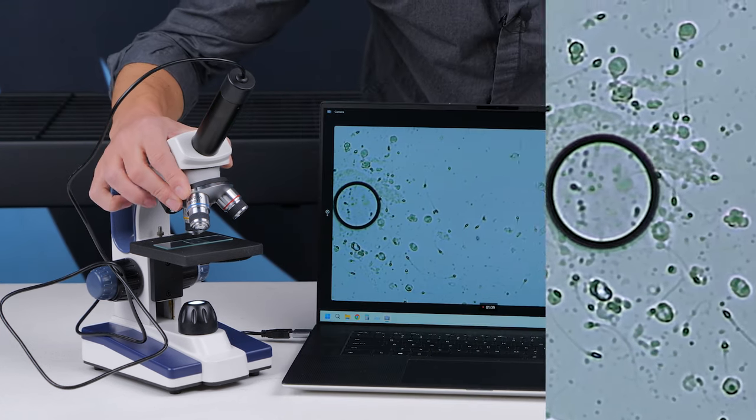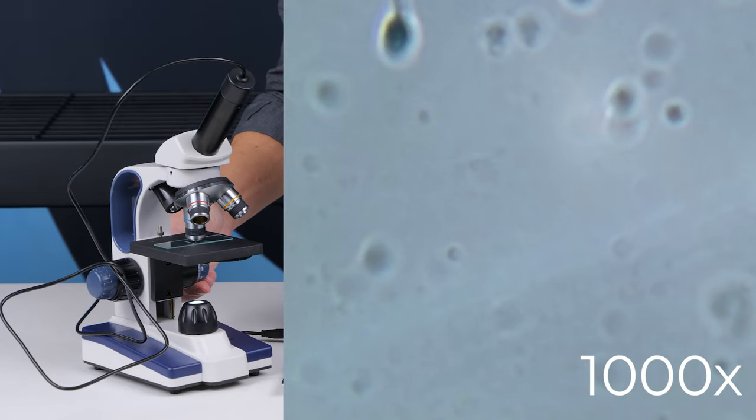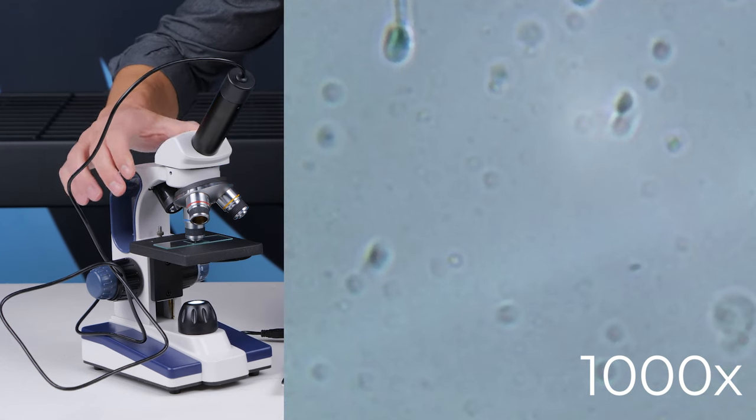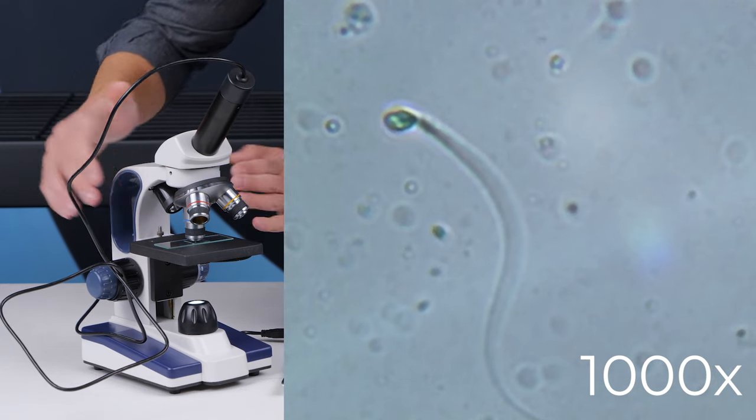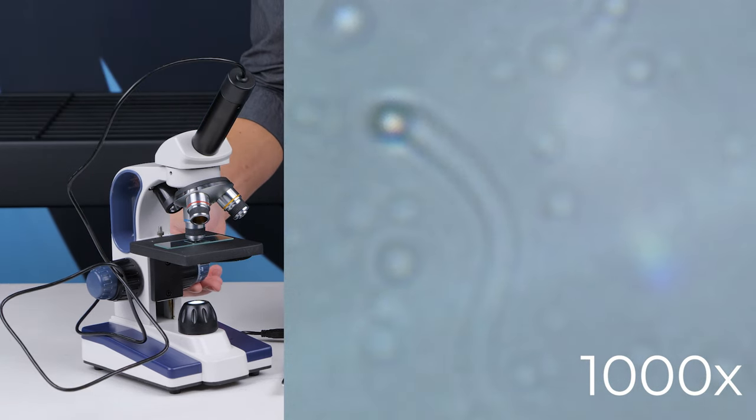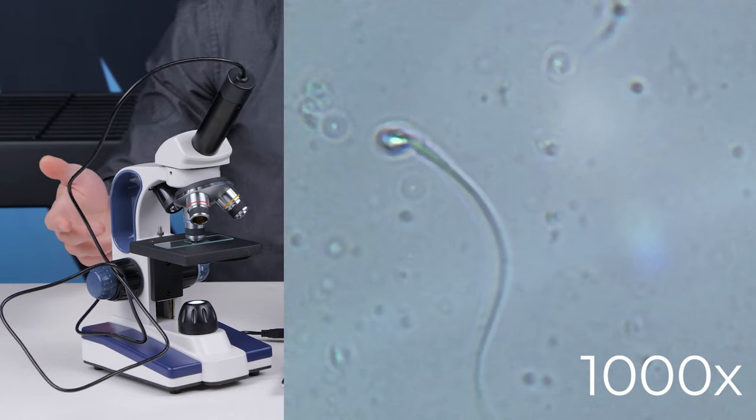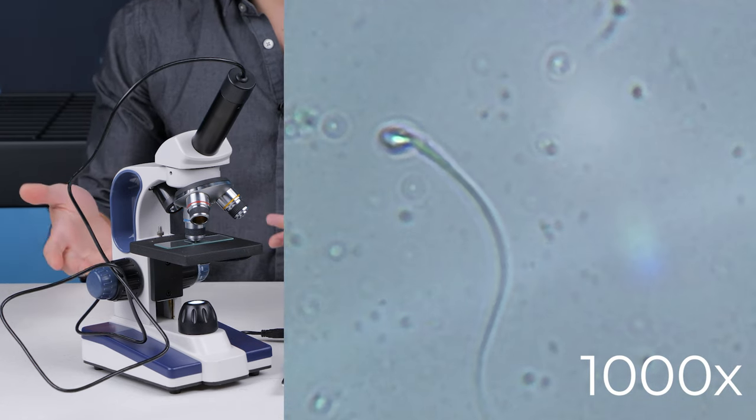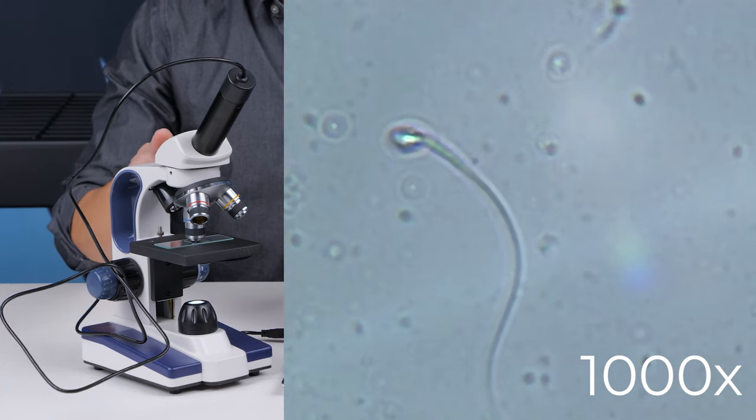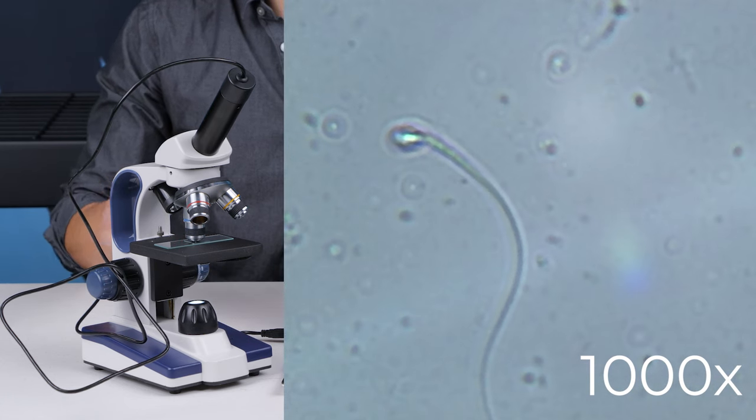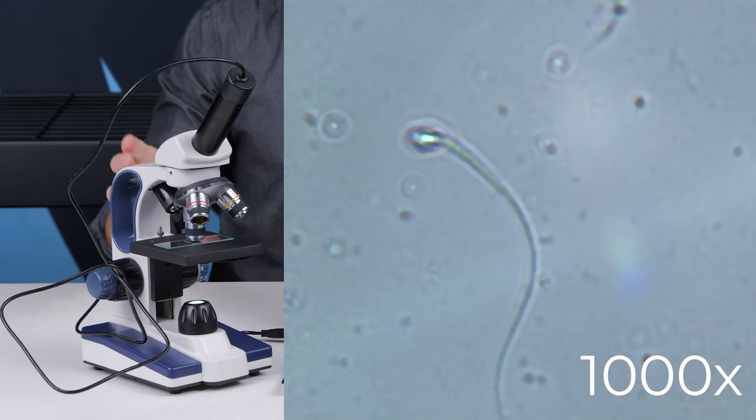Now going up to the highest magnification objective, this is a 40 times magnification objective for a total of 1,000 times magnification because the camera adds a little bit more as well. You can see there are some sperm that are kind of outside of the field of view. And there's one. You can see what that looks like at 1,000 times magnification. Yeah, pretty clear, pretty easy to tell what's sperm and what's not sperm. In a clinical laboratory setting, they're going to be using a phase contrast microscope, which makes them even more obvious. But I would say that if you just get the correct lighting system on a regular brightfield microscope, that'll totally work as well. Again, you can check out the what microscopes can see sperm video. There's a lot more detail on the illumination system.